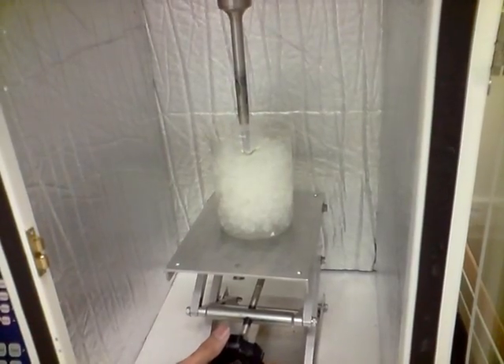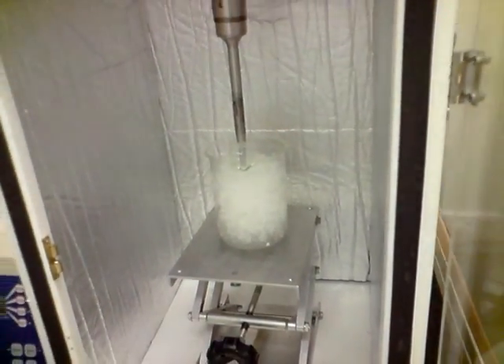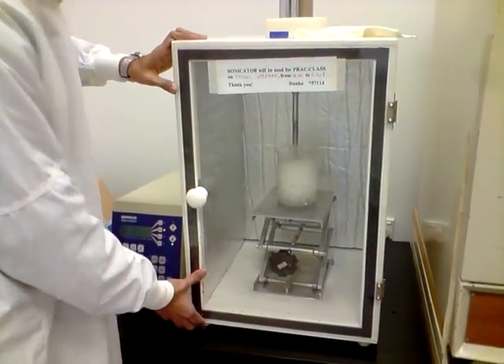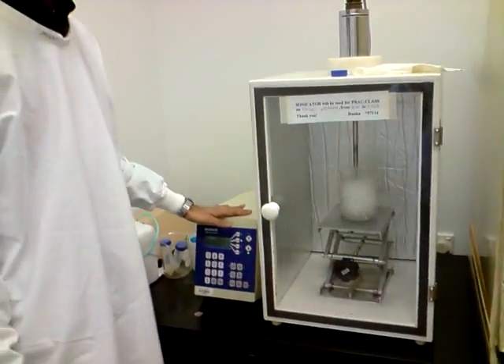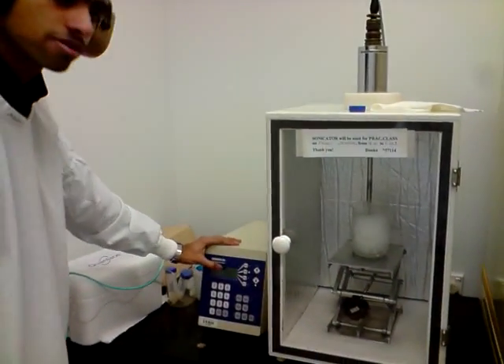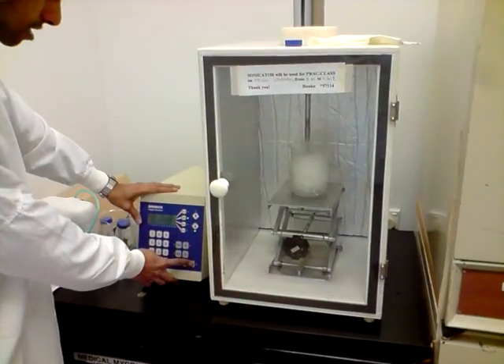That's it — all set to start. So we will close the glass chamber. You might not be able to hear anything when the sonicator starts, but it gives a slight shrieking noise. It has been set for 3 minutes with 30 second gap intervals in between, and we will start the test now.